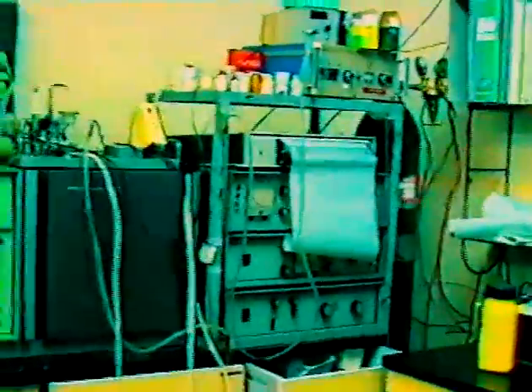So we have here two gas chromatographs. This is the Hewlett-Packard type. I'm sure you know that, but more exotically, this is a Czechoslovakian-made old gas chromatograph. But it works and we are doing experiments.